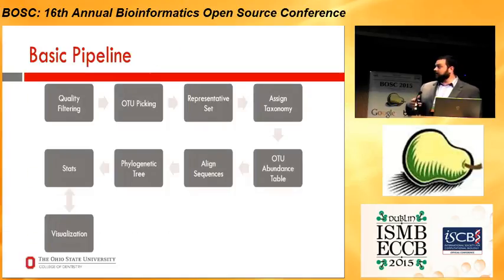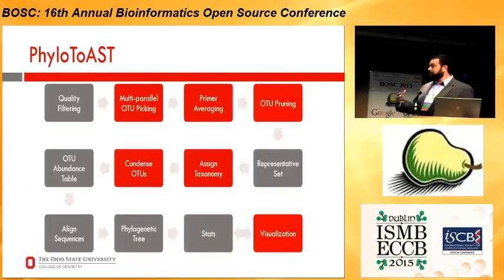And we eventually just organized them into a single package to provide parallel but yet intercalating tools for analyzing 16S data, mainly with the QIIME pipeline in mind, but where possible we use open interoperable data sets, from simple CSV to, and now I'm blanking on the term, but other open standards for data where possible.